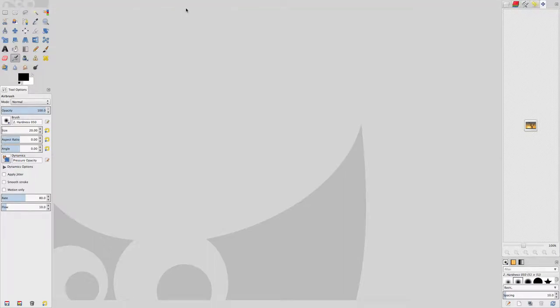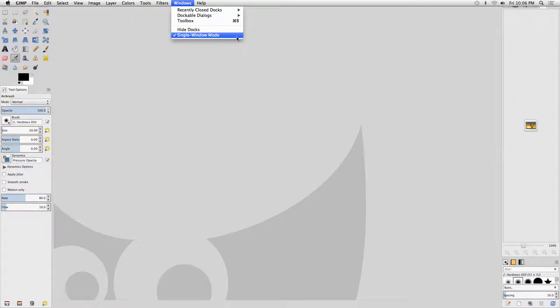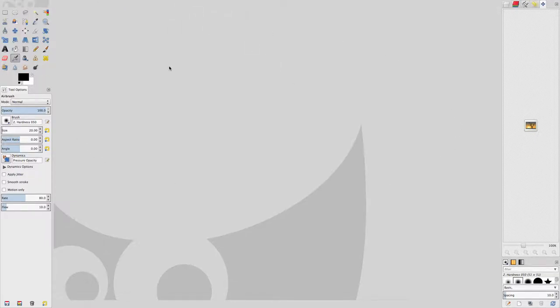On an OS X machine, please make sure one of the GIMP windows is active by clicking on its title bar, then click on the Windows menu at the top of the screen. Select Single Window Mode from the Windows menu to consolidate everything into a single window. The new single GIMP window may need to be dragged to be centered on screen, and should look like this.